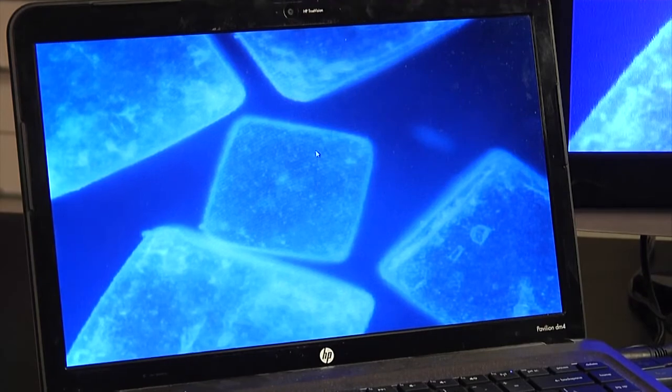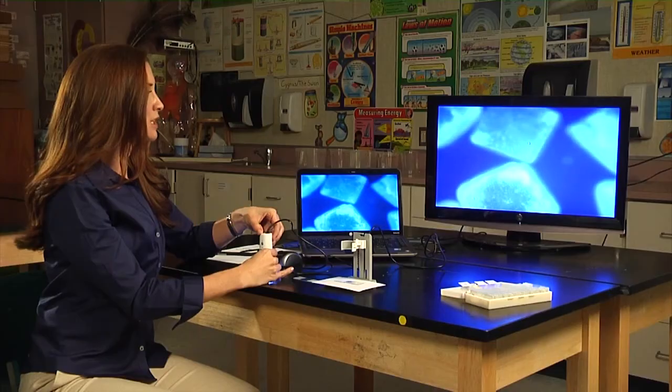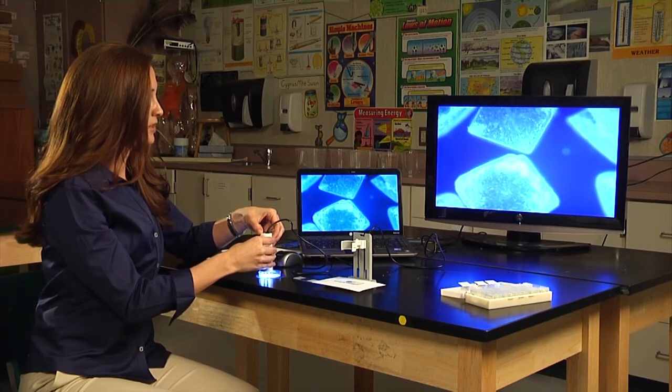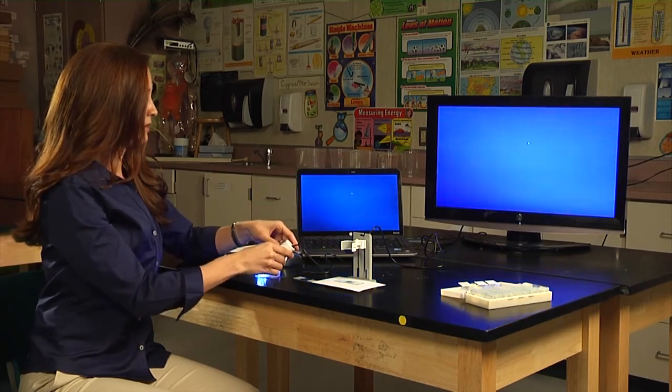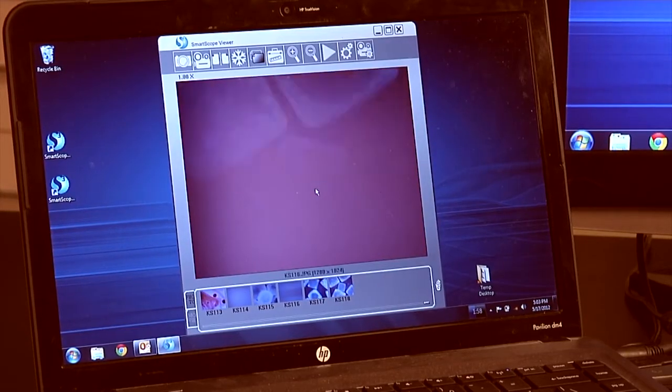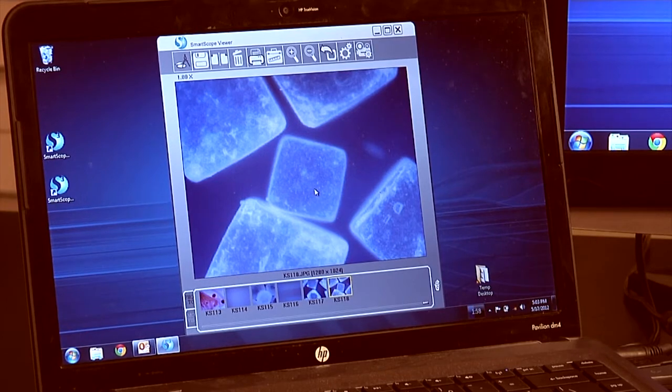You can see all of the textures. You really get such a clear picture. So if you want to capture that, just take a photo. And then to view the photo, all you have to do is double click, and then you can drag and drop. And there's your photo.